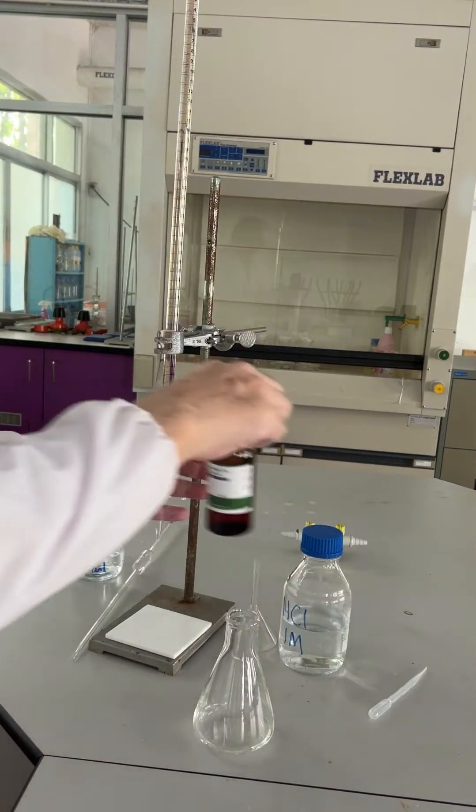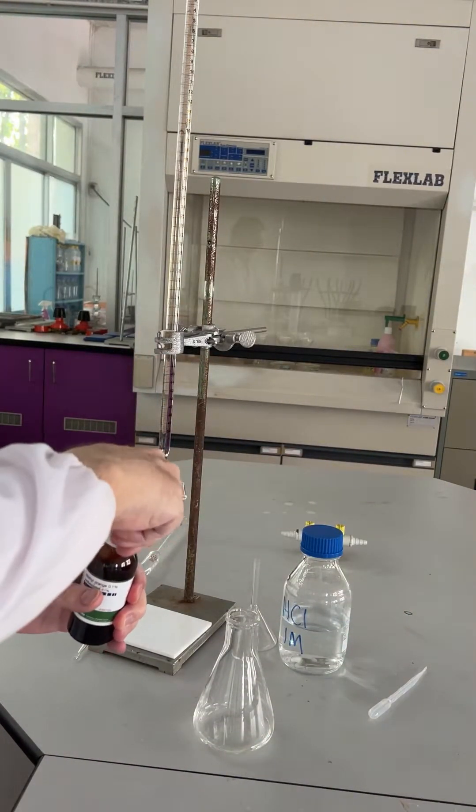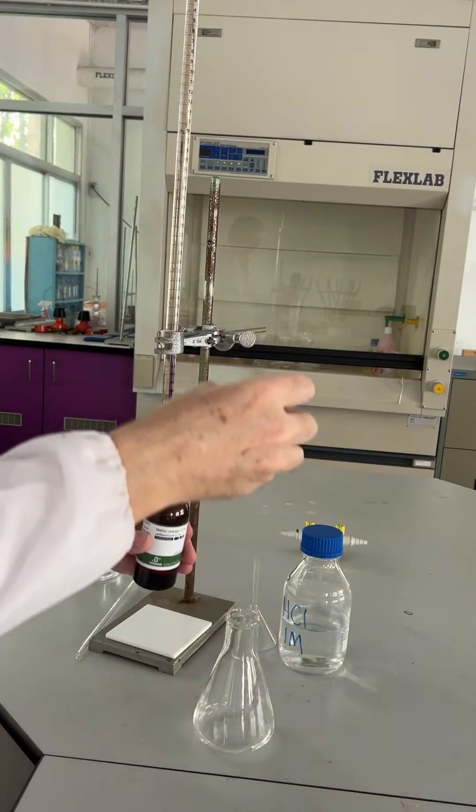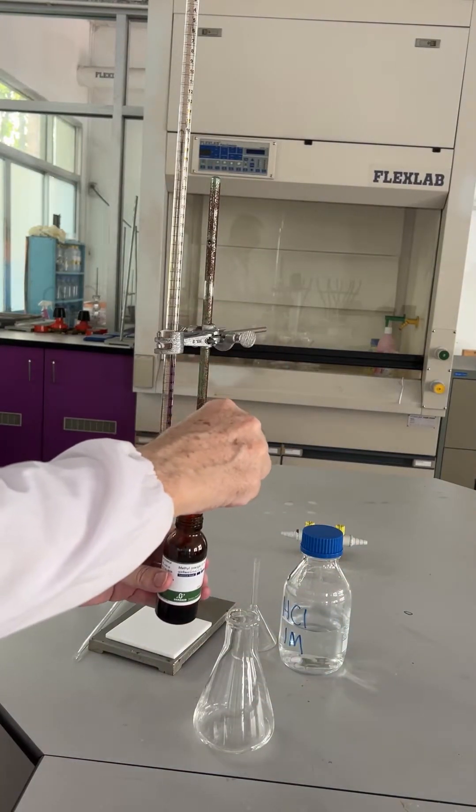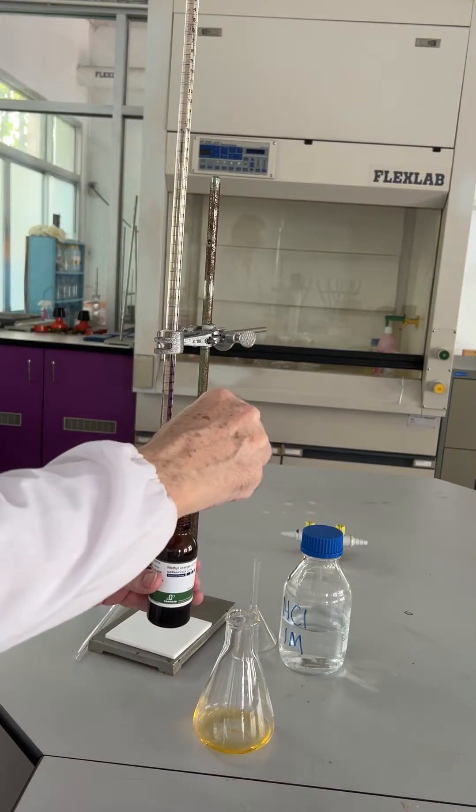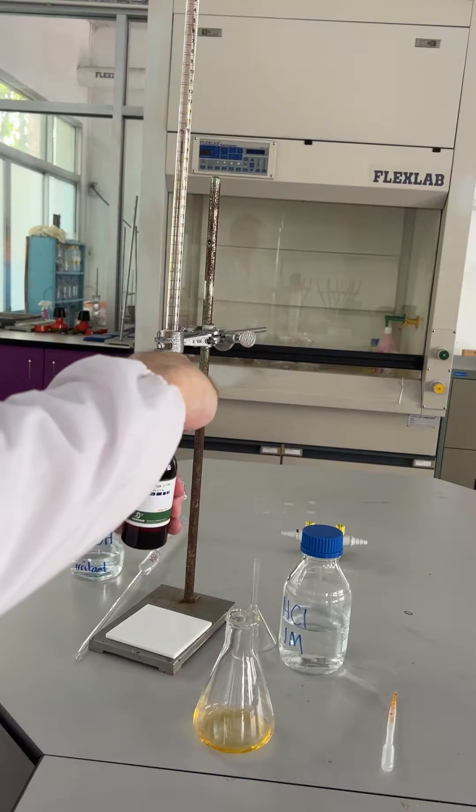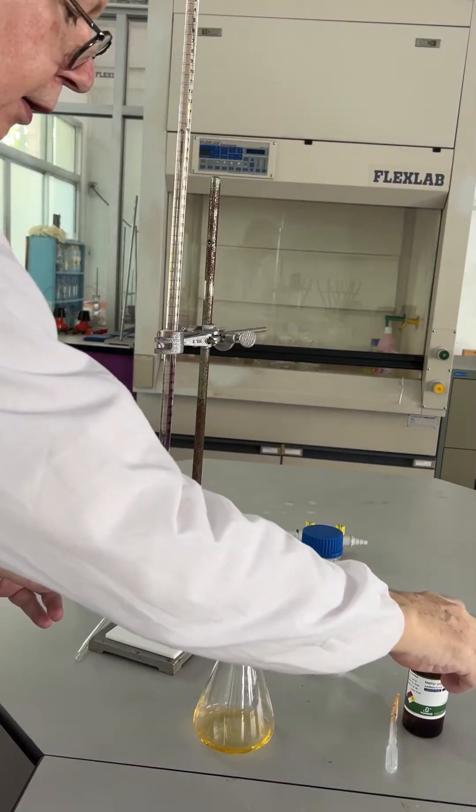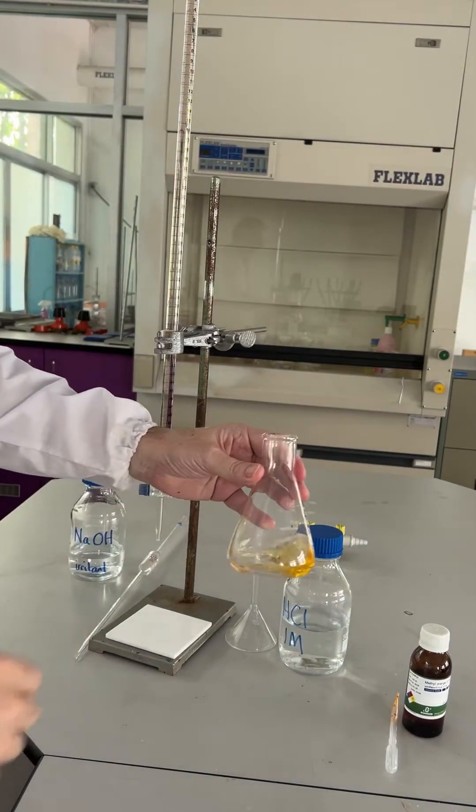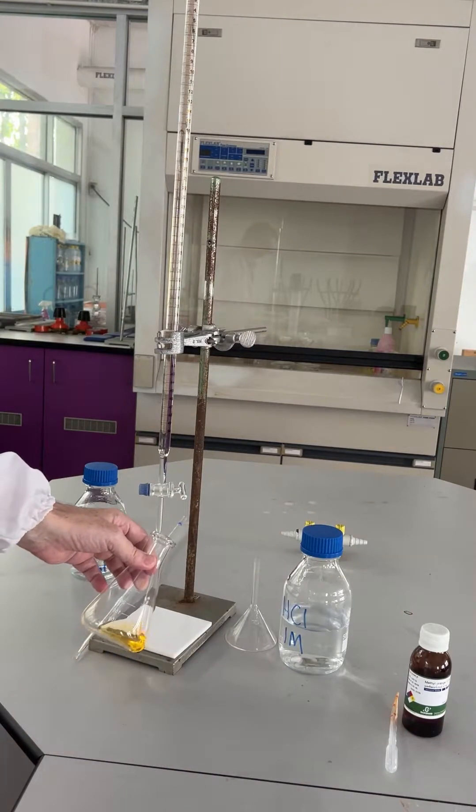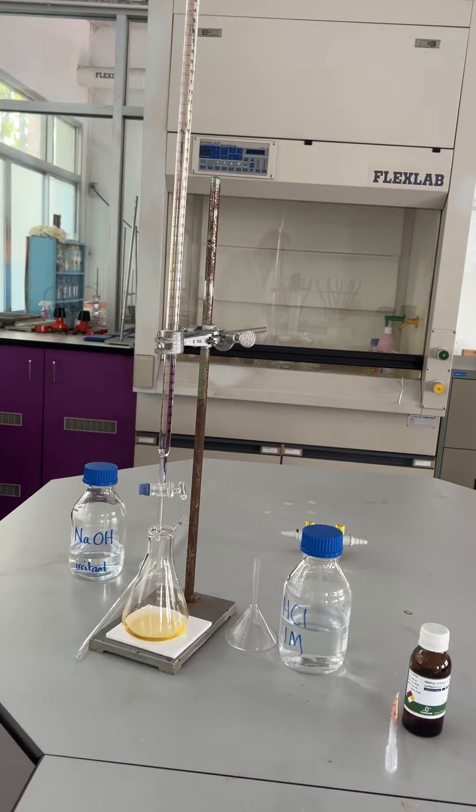Into which we will add three drops of methyl orange indicator. You should be able to see that the indicator is a pale yellow color. The indicator is a pale yellow color in alkali.